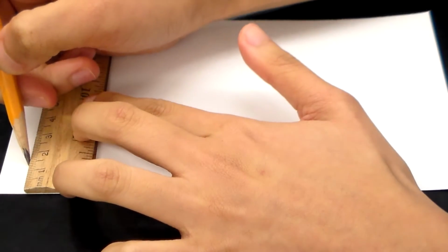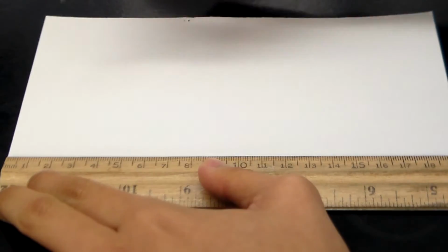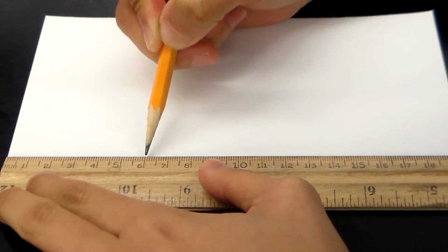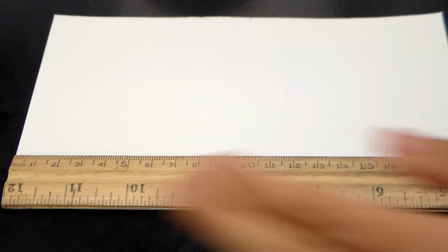Let's get started. Get a piece of chromatography paper. Draw a light pencil line 1.5 centimeters from the bottom. Mark 9 points on the line, about 2 centimeters apart, and 2 centimeters apart from each edge. Number each spot 1 through 9. Be sure to use a pencil and not a pen.